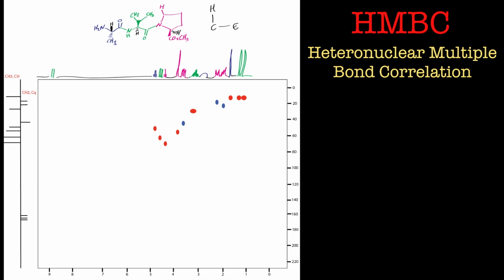It can look at multiple bonds, so you've got one bond there. Let's do this in red. So that's bond 1, that's bond 2, and if we do this one here, we'll end it at 4, but that's 3 and that's 4. You can actually look at this proton connected to this carbon. Also remember, we're looking at carbon 13, so you'll never see a signal for carbon 12, only for carbon 13. It doesn't mean you have to have 4 carbon 13s in a line, it just means that the one there has to be carbon 13 if you're going to see it.